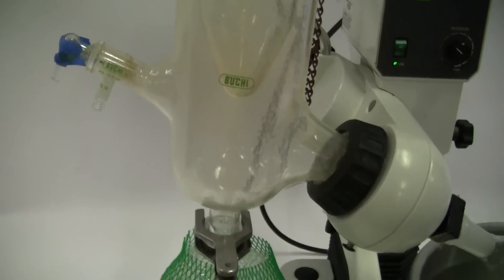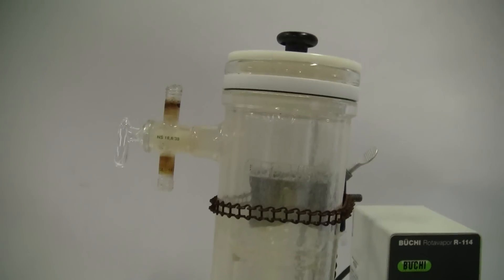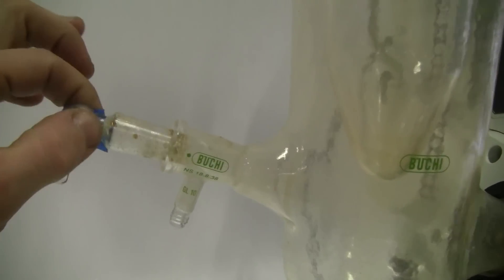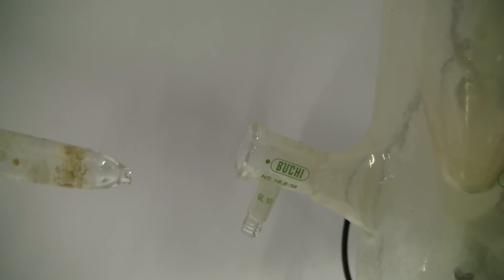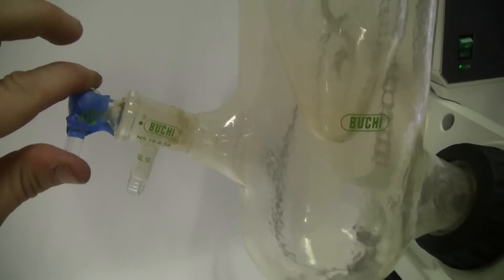Here's the glassware that's going to come with it. This piece right here is marked with blue tape — we are going to replace this broken piece. It will be replaced before you receive it.